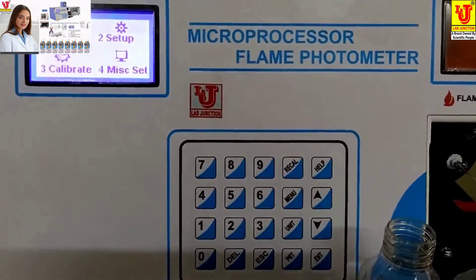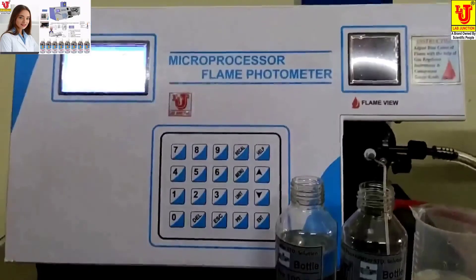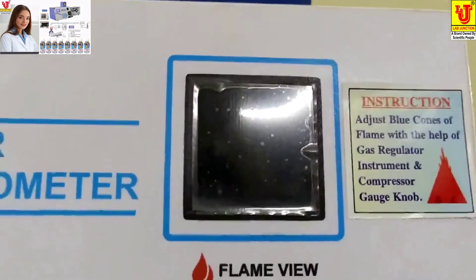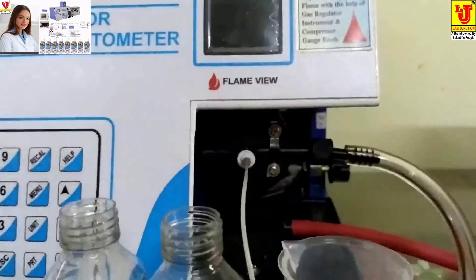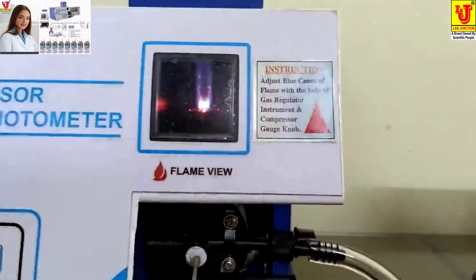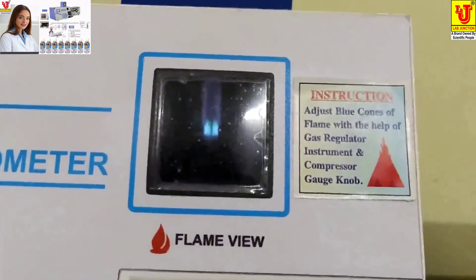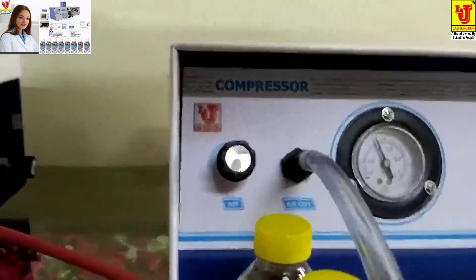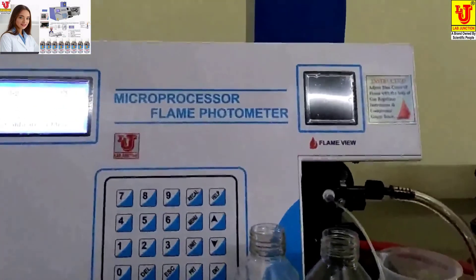Now, if the setup is ready and you switch off the gas cylinder supply, you can see the flame goes out. Switch the gas cylinder supply back on and press the manual ignition — automatically the same flame will set up again. There is no need to set up the flame again and again if you do not disturb the gas regulator of unit 1 or the air regulator of compressor unit 2. This is the final demonstration of the microprocessor flame photometer.